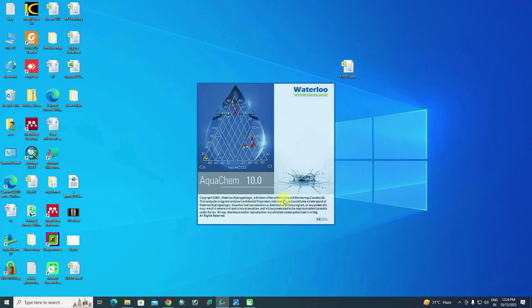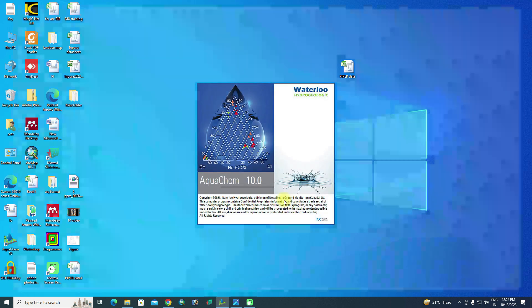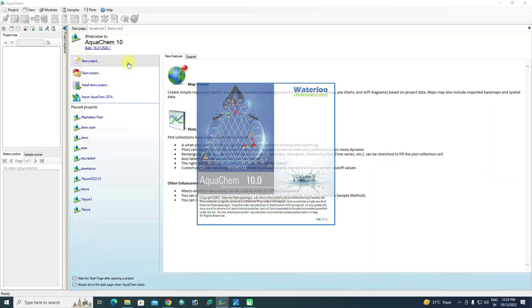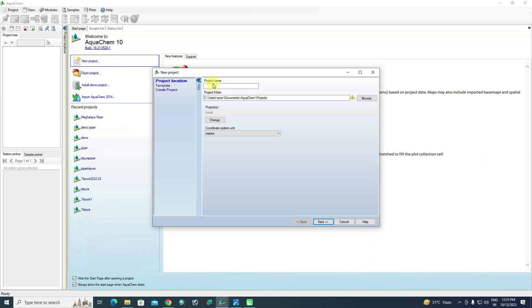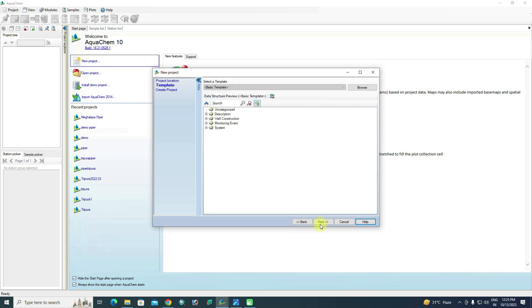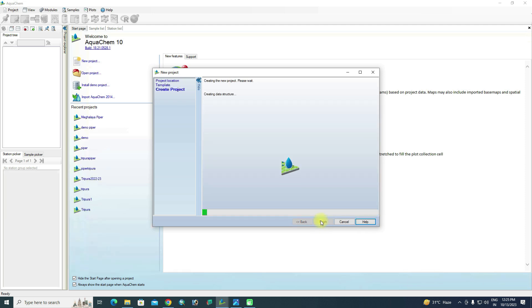Now open the AquaChem software — it will take some time to load. After opening, go to New Project and give the project a name. I am naming it 'Meghalaya Piper'. No need to browse the file here — just click Next, then Next again, then Finish.